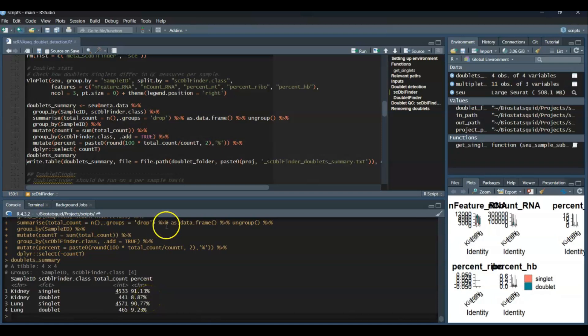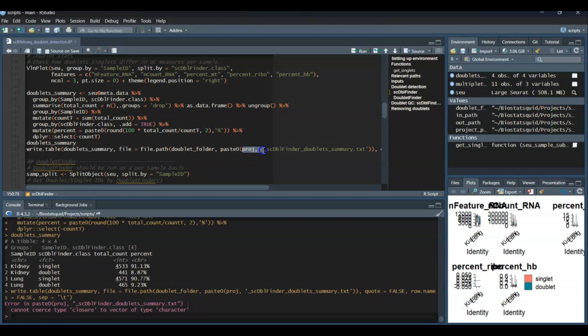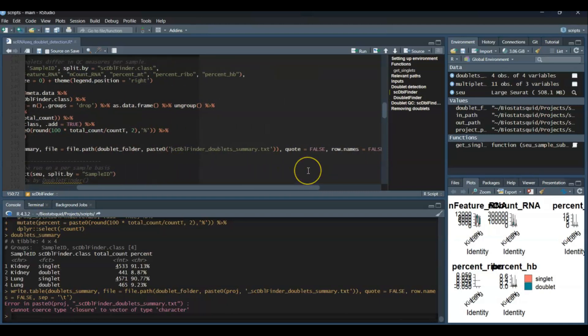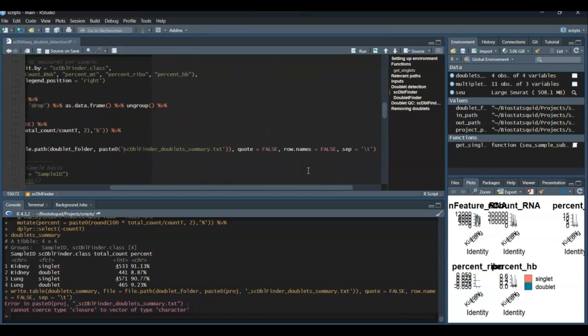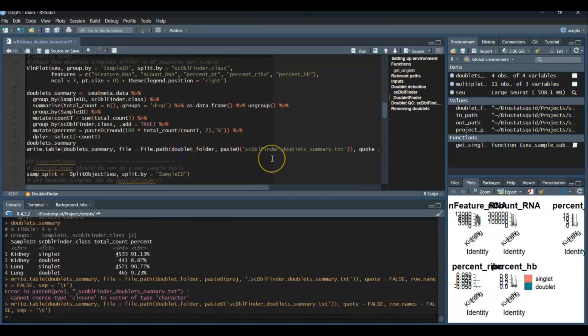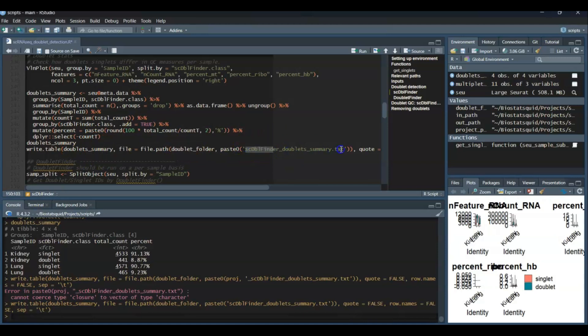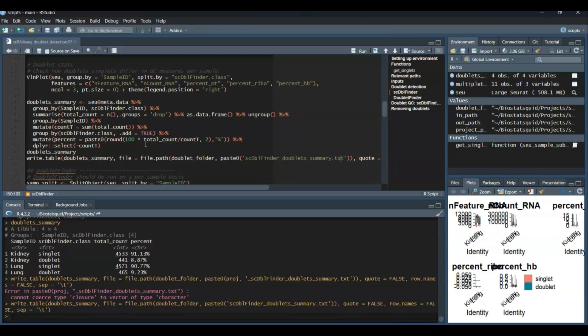And of course we can save this table onto a file, which I do in this line here. So I'm just saving it onto our doublet detection folder. Remove this because we have just one project. And try again. So now we have our doublet summary in this folder with this name.